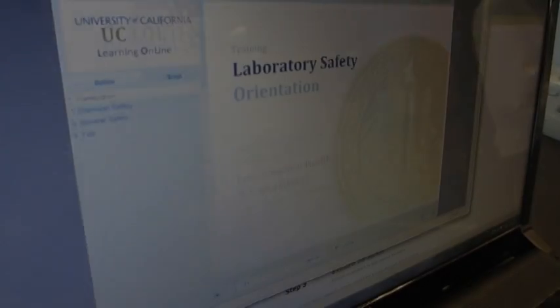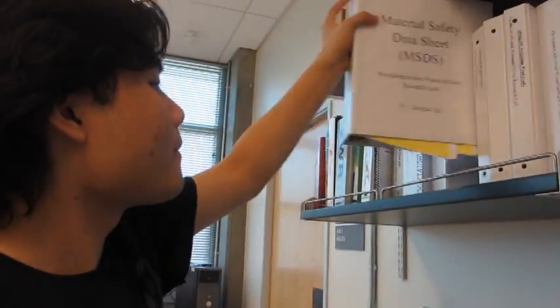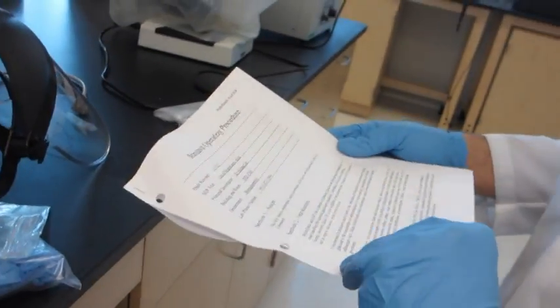Before beginning, make sure to complete the appropriate laboratory safety training before working in the laboratory. Then review written documents to inform yourself of the hazards of the chemicals you're working with. This includes the laboratory safety manual and/or the chemical hygiene plan, the safety data sheets, and the standard operating procedures for your work.